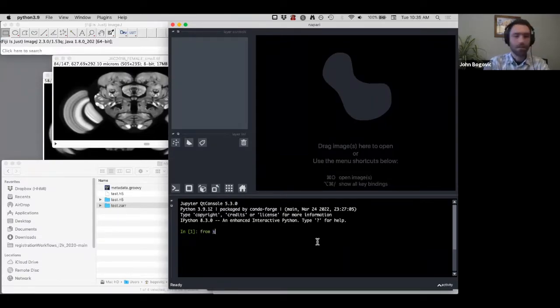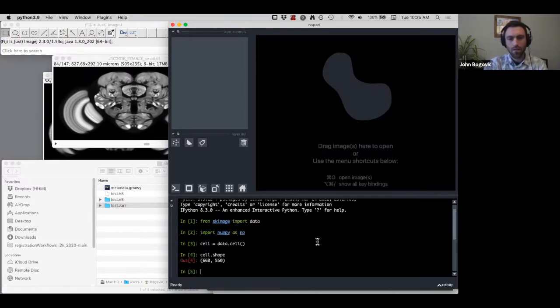So we'll say, I think I need, okay, so first I'll just read some data. I think this is what I want. Good. Do I need to, I think I need to do this. If there's Napari experts, just check my code.